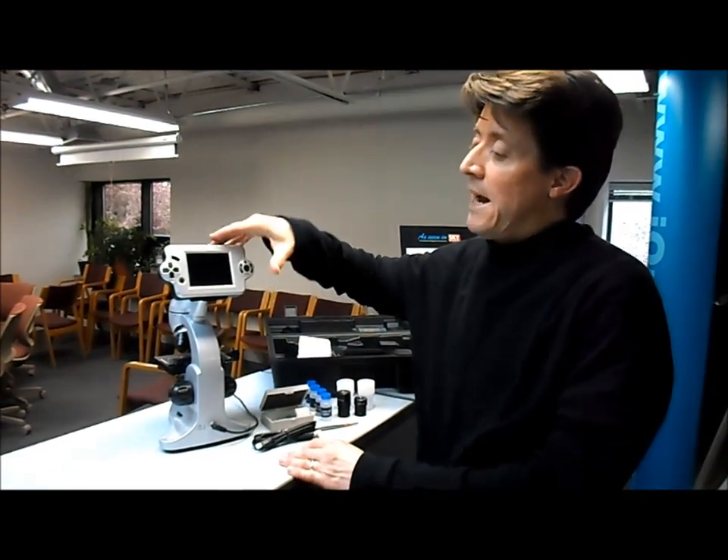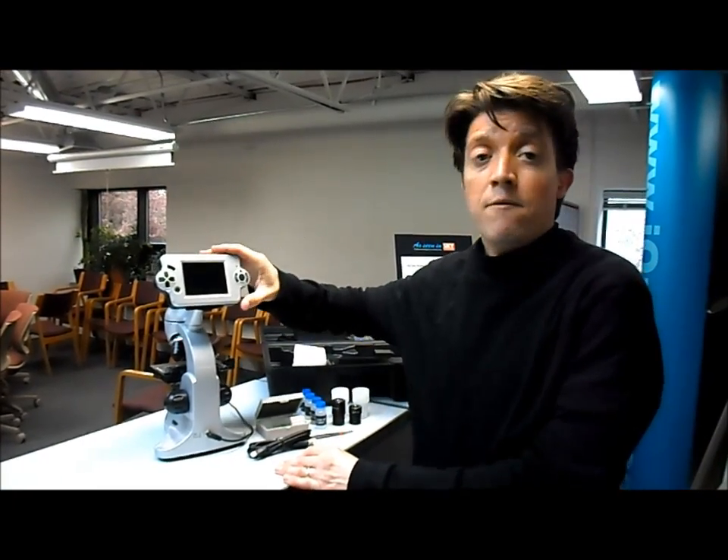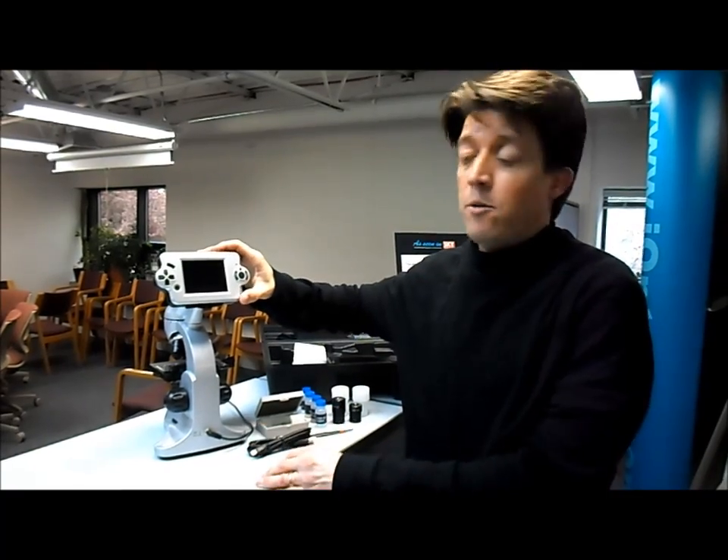The LCD screen can actually increase the magnification 8x, so you can get a total magnification of 3200x, which is pretty good for the price.